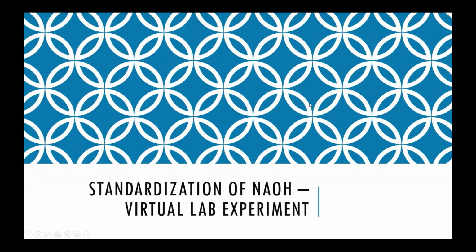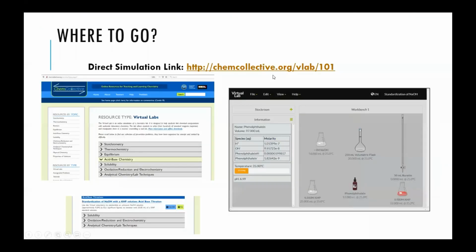The experiment itself is a virtual experiment, which is performed at the Chem Collective site shown here. The reaction in the lab is the reaction of potassium hydrogen phthalate, which is an acid, with sodium hydroxide.